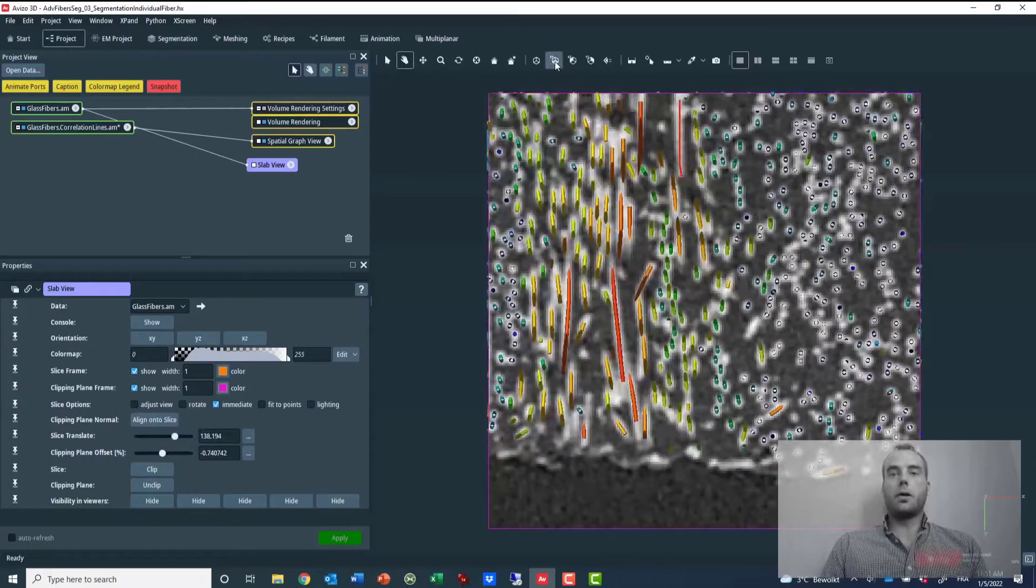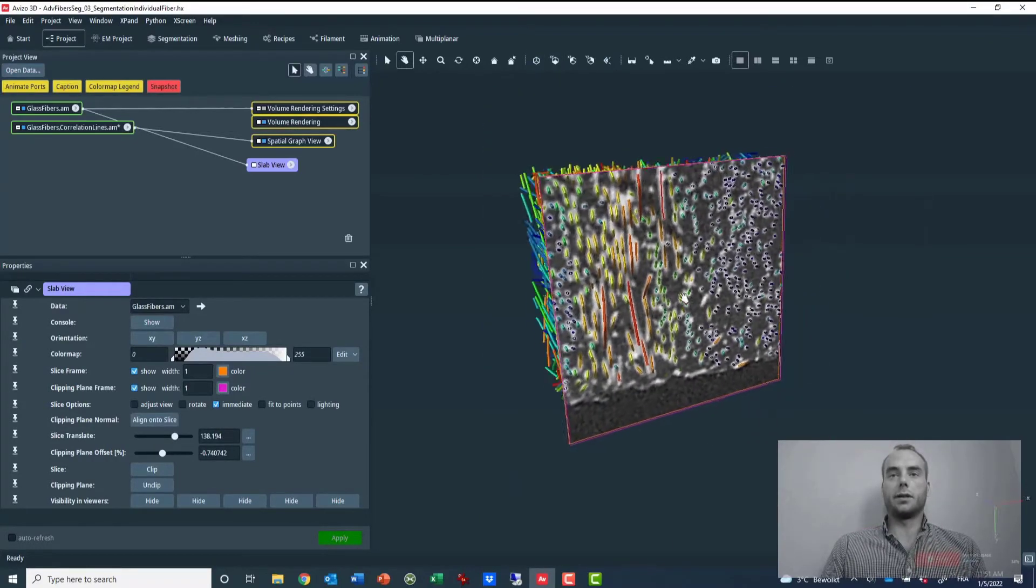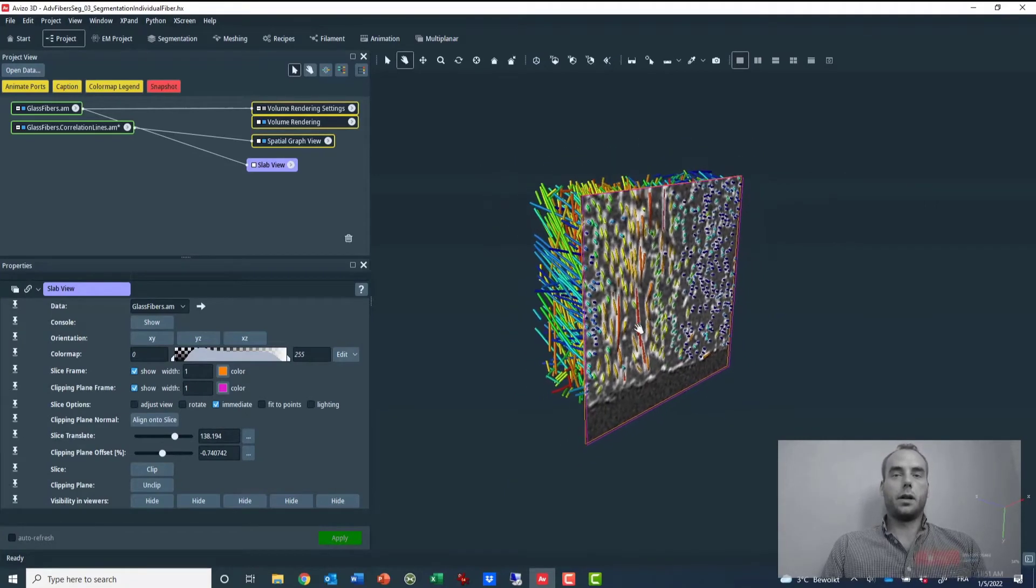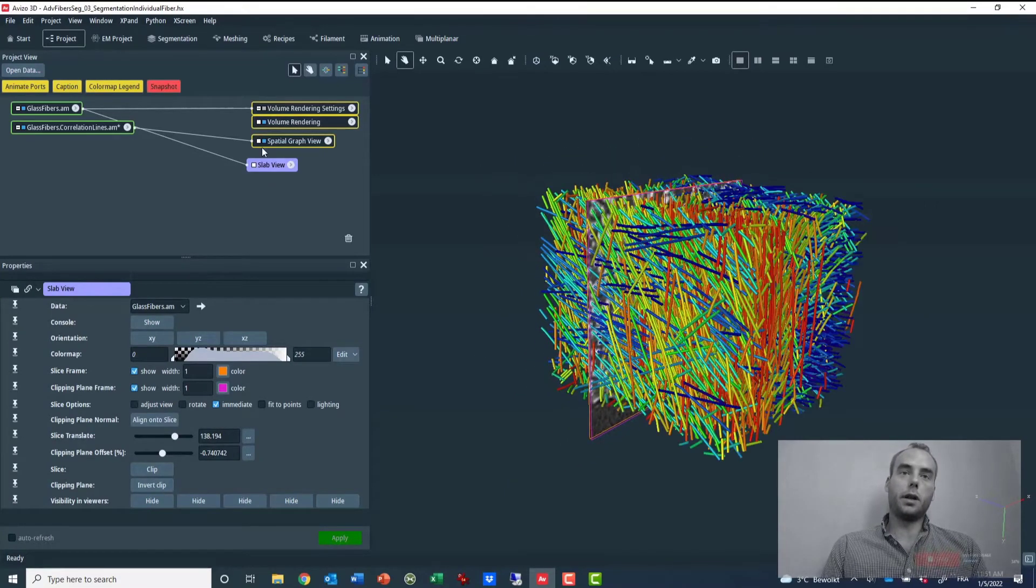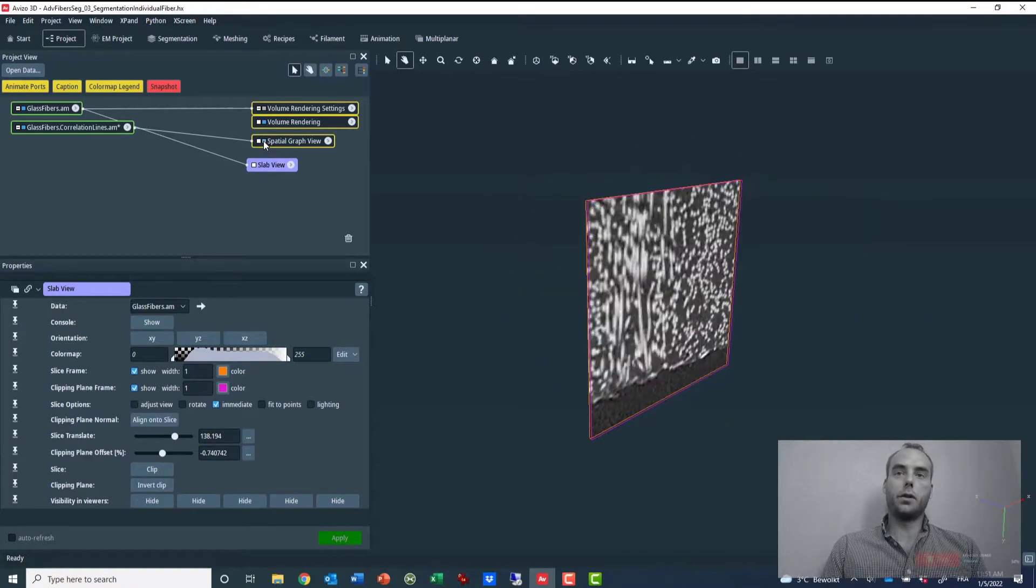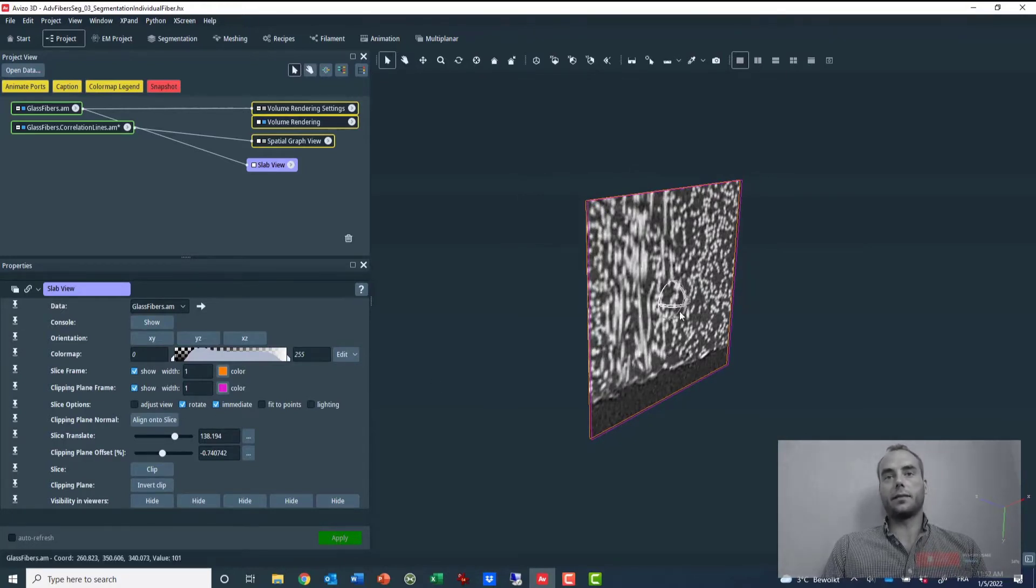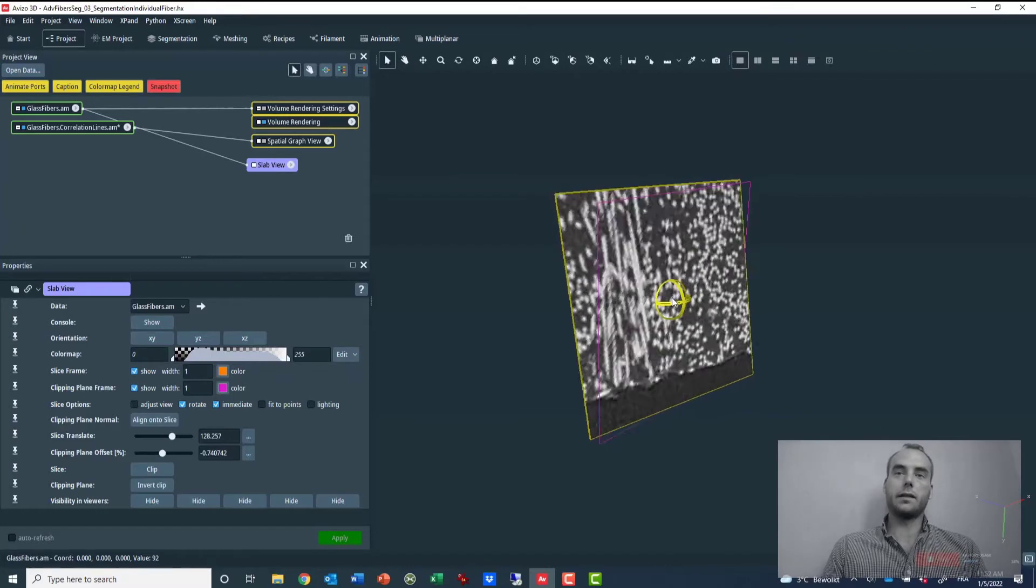I also have the possibility to rotate the slice and therefore the inspection. So for that I will temporarily hide the rest of the scene. Then I can rotate my slice interactively, just like that.